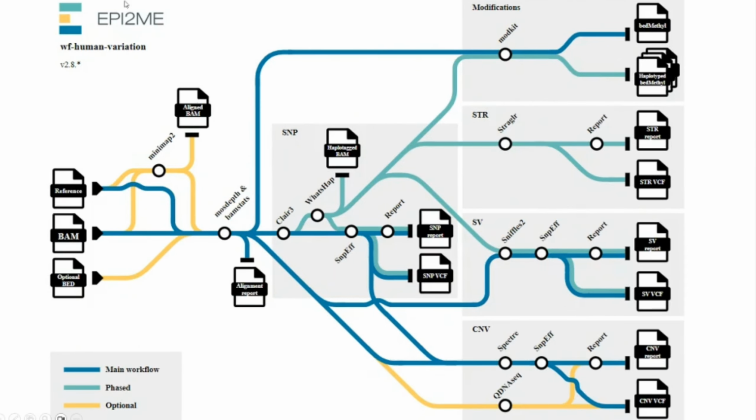The steps involved: it will map the sequencing data against the reference genome that we select. From the mapping or the alignments, it will come up with stats on how the overall alignment looks. And then from there, it will proceed to do the SNP calling, if we are looking into small variants like single nucleotide variations and small indels, small insertion deletions.